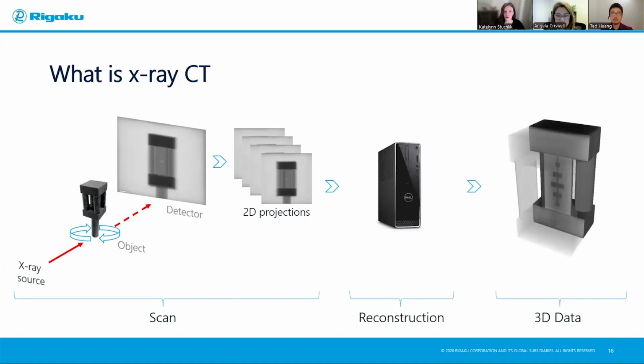So essentially you make a digital clone, putting your sample into the digital world so you can do whatever you want, multiple times, slice it open, and so on and so forth. And you can see in this process there's no destruction involved. The only place that might be destructive is when you're trying to put your sample in the chamber, right? Once your sample is in there, there's no destruction.